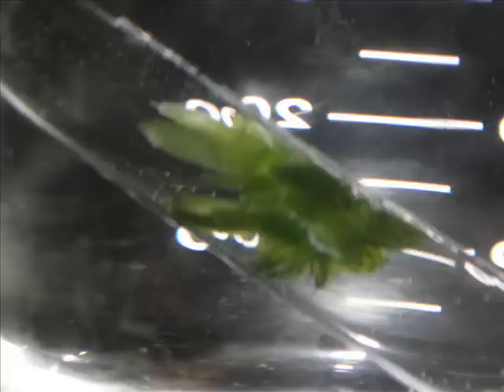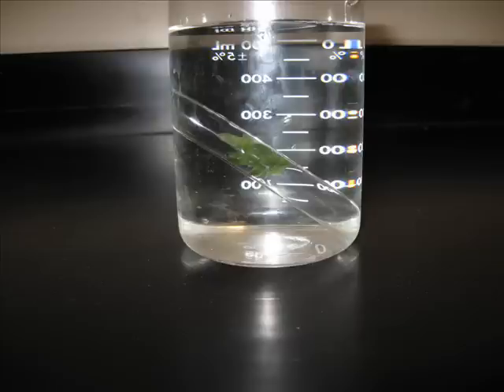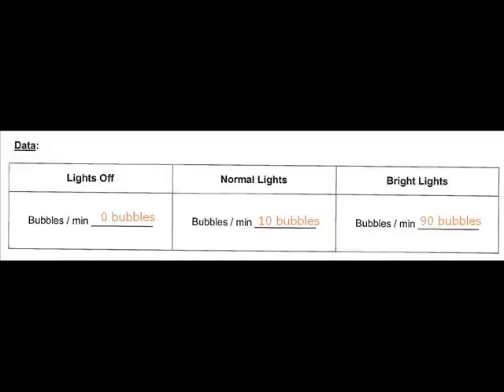Here is the setup for the lab. You can see the plant inside a test tube. That test tube is full of water with a little bit of baking soda, and then the test tube is placed inside of a beaker, which holds the test tube so that you don't have to hold it and so that you can view the bubbles that the plant will make. Your first test is to have all of the lights off — we did this for five minutes. You should be looking for bubbles coming out of the stem of your plant. We found that zero bubbles came out of the plant with all of the lights off in the room. Please record this in your data chart.